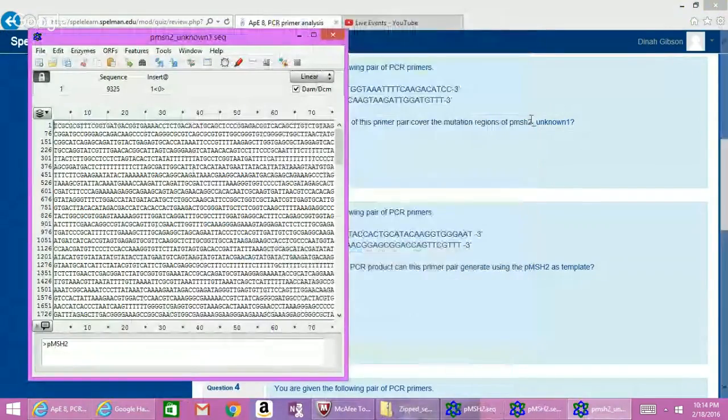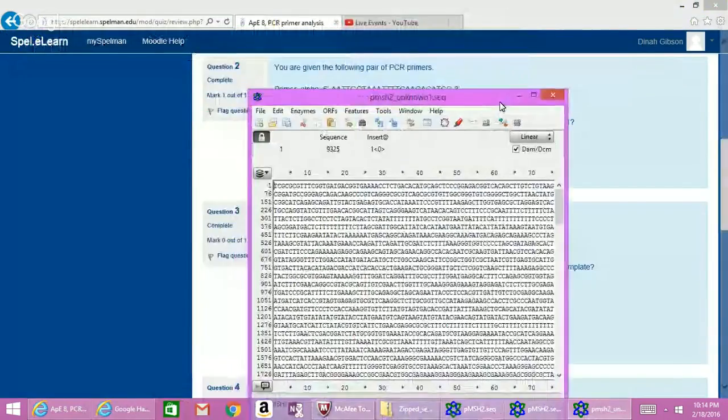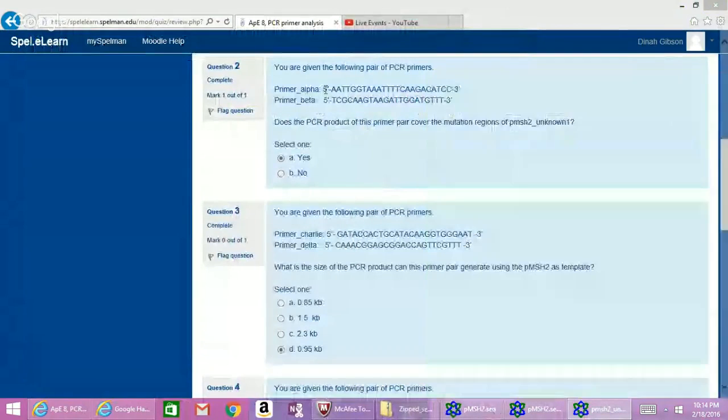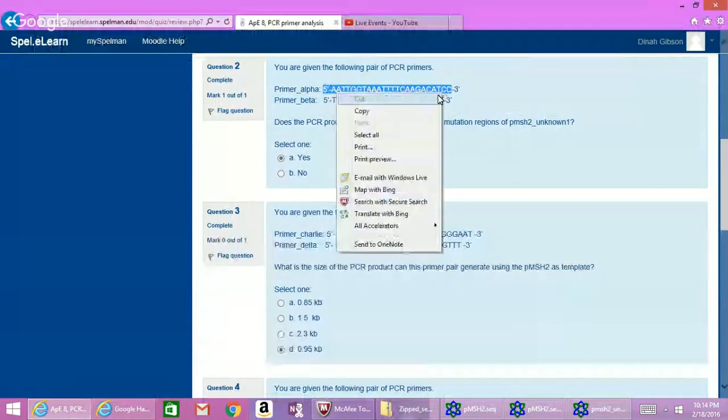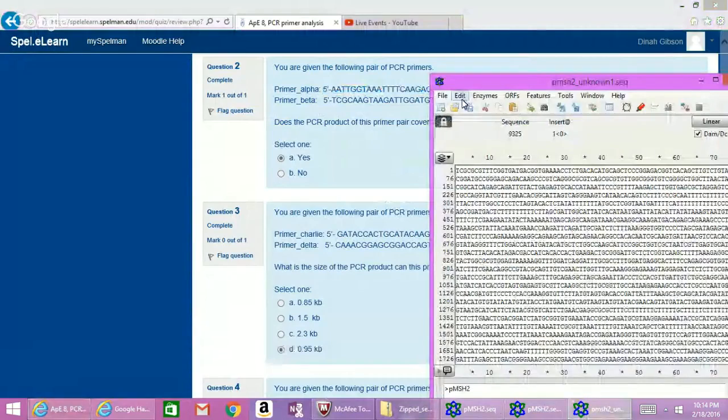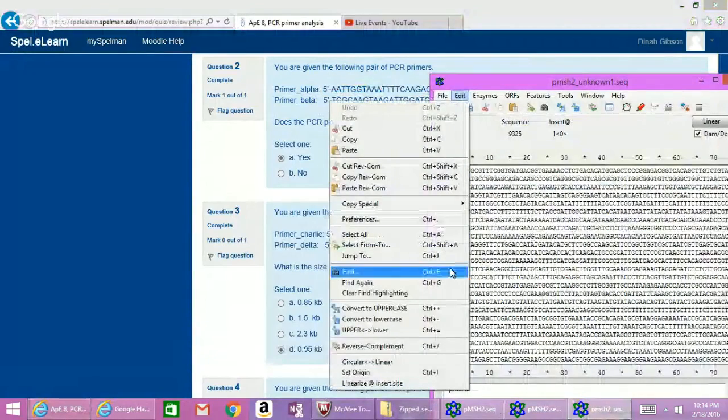Okay, so what I'm going to do, I'm going to copy our alpha primer for our unknown. I'm going to go back to the unknown, and I'm going to find it.